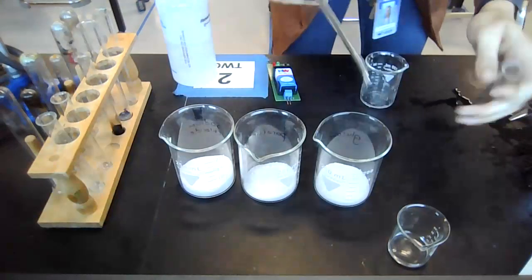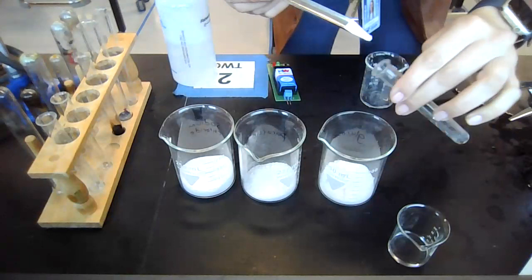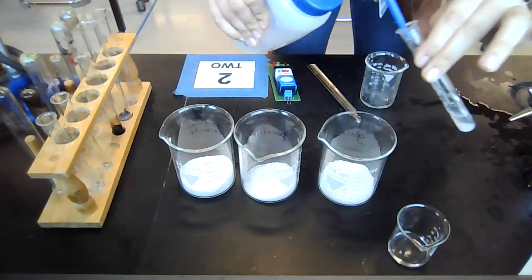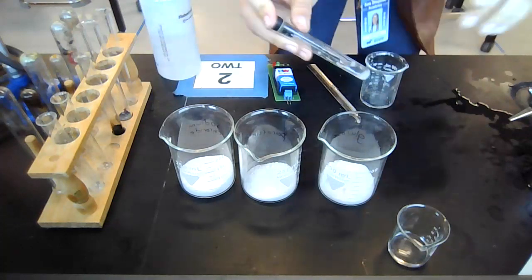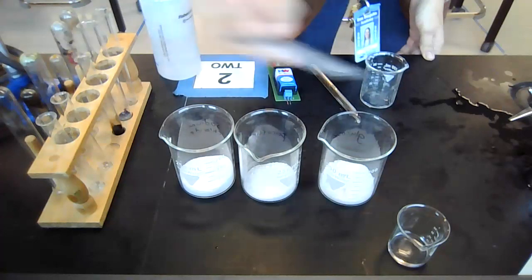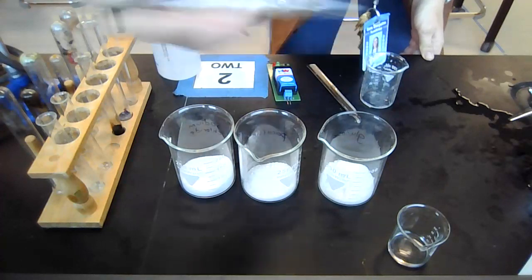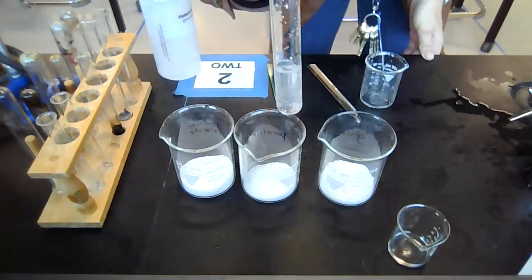I'm now going to do glucose. So if I grab some glucose, which is, again, a fancy word for sugar, add some water into there. And again, I'm adding that deionized water because I want to use it for my next test. Stopper it and shake. You can see this one dissolves. It's starting to dissolve into the water and just starting to go away.